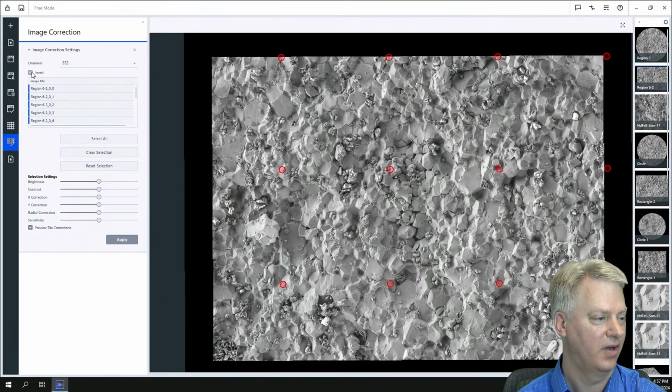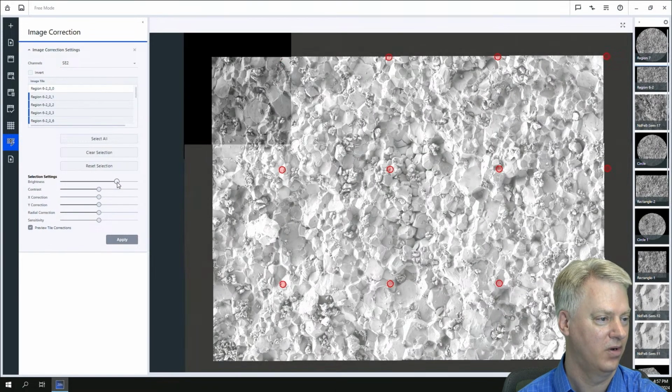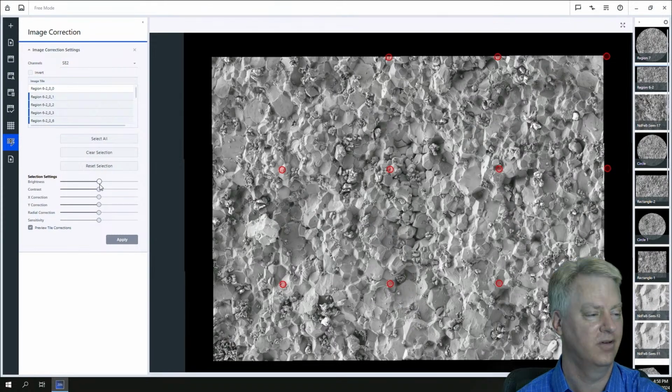And okay, so I mentioned before that if there were some mismatch in the shading of the brightness, contrast, or gamma on the boundaries between the different tiles, we can adjust that. You can adjust it either in the X or the Y direction or radially. You have different settings here that you can adjust. You can adjust them for each individual tile if you want. You can tell, like right now, you can see where the upper left tile is definitely accentuated, which would not be good. And where it had it to begin with actually worked out quite well. So you really don't have to do much here.